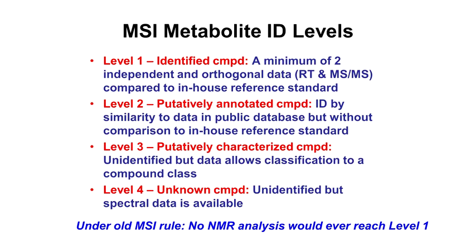You're measuring against 10, 20, 30 peaks, and you're also measuring against their intensity differences. So not only their chemical shift, but their intensity patterns have just as much information. So in that regard, people are pushing to a revision of the MSI standards, which would allow basically most NMR analyses to reach level 1.